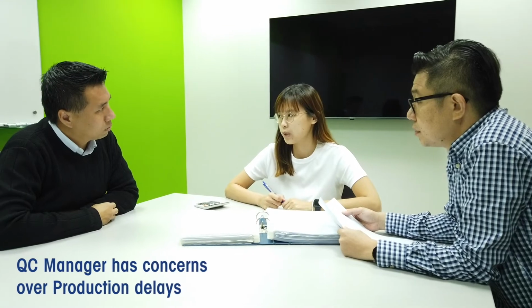So do we have any more samples left to rerun batch 8 again? We should have enough sample for one more run. Okay, then let's rerun this to verify the results. Okay, sure. This batch is due for delivery by tomorrow, so I need the result by this afternoon. This afternoon is a bit tough as we have a lot of urgent incoming samples to run as well.